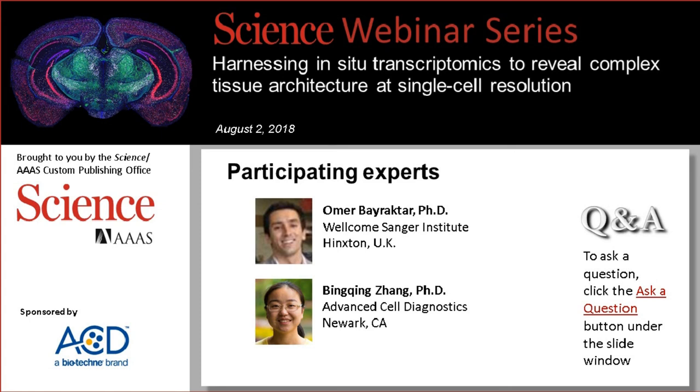Right now on mouse tissue sections, we were more confident of our ability to segment neuronal soma, the cell bodies. But I think that if you have good markers of dendrites, and if you can precisely segment and quantify dendritic processes through thin or thick tissue sections, there should be no impediments to quantifying their dendrite localization.